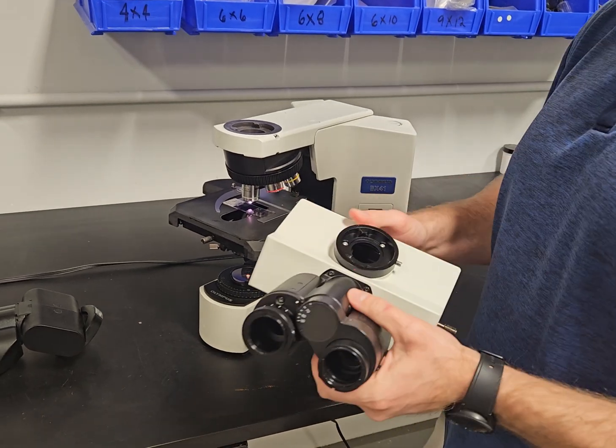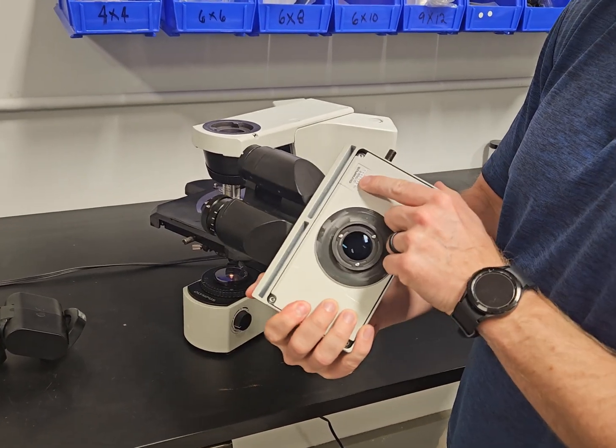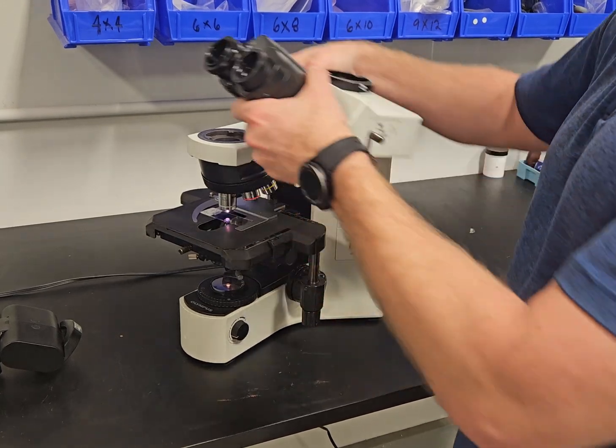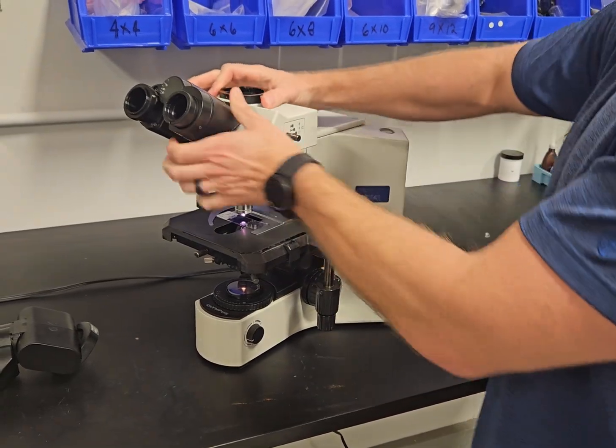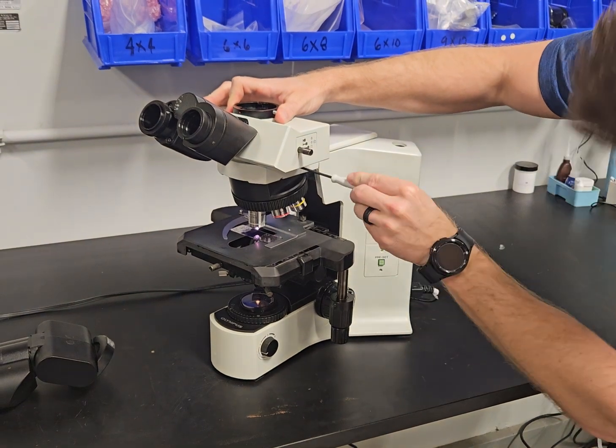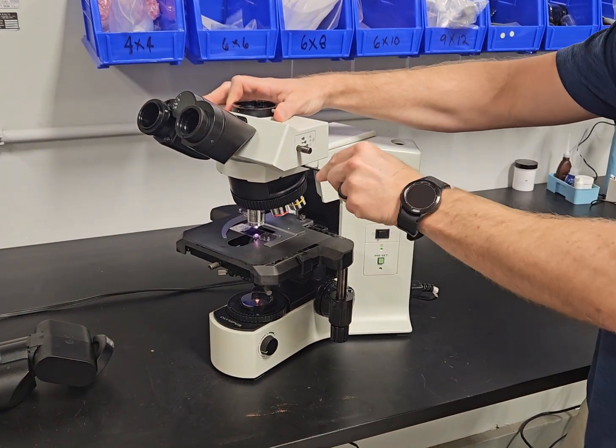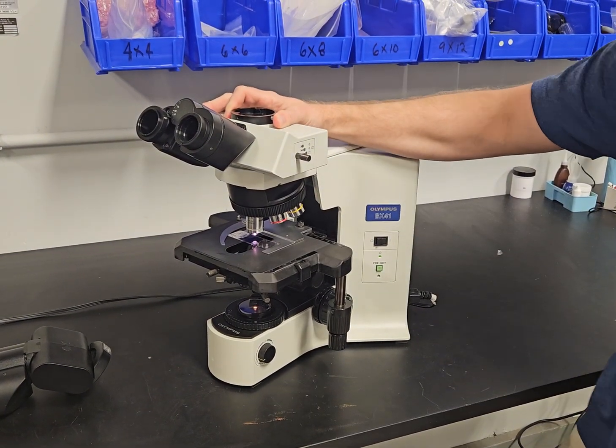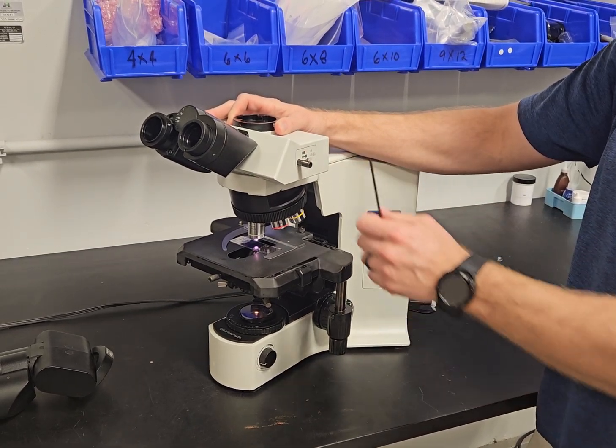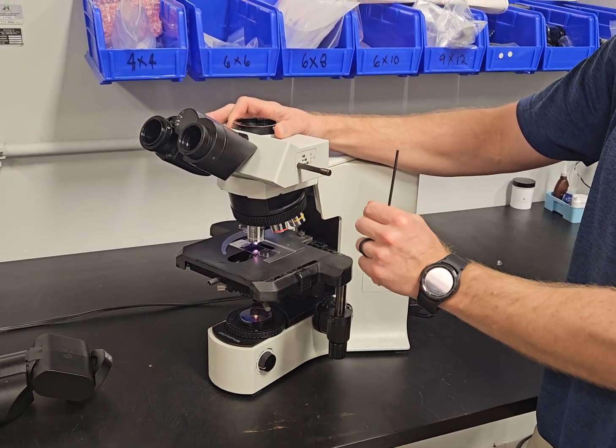This is the trinocular head, the U-TR30-2. This head would go on just like the tilting head. We're going to take the three millimeter Allen wrench, put it on. Never want to take your hand off of the head until you know it's tight and then it has a pull rod on it.